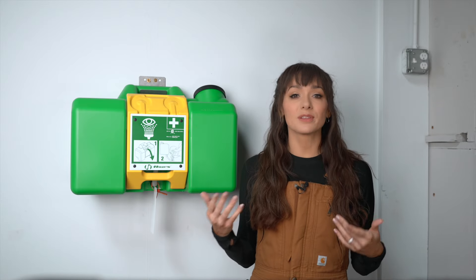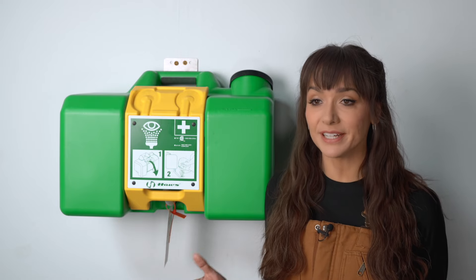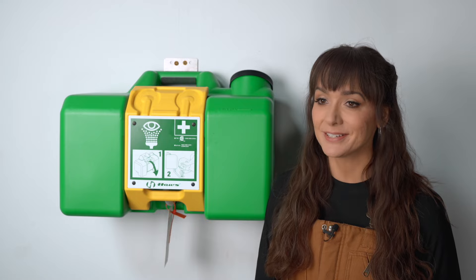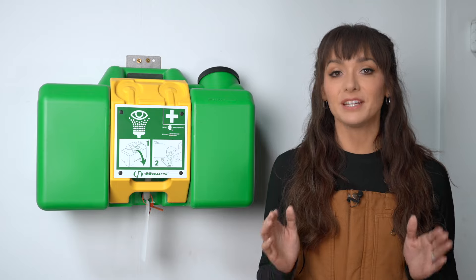There aren't a lot of emergencies that trigger the same amount of panic as getting something painful in your eyes. It's when you're blinded and in a hurry to find relief that eyewash stations need to be available and ready to use. With that in mind, here's your quick guide on how to inspect your facility's eyewash station to make sure that they're ready when you need them.